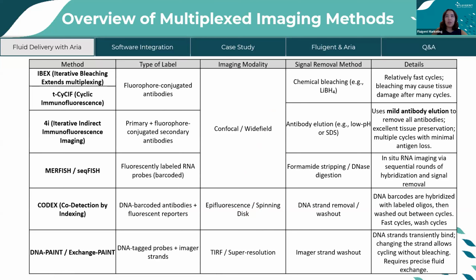And finally, you have a step of inactivating agents. It can also be different in chemistry. It can be an optical bleaching with a laser. It can be a chemical bleaching. Depending on the type of label and the conjugation, you would have a different removal method as well.